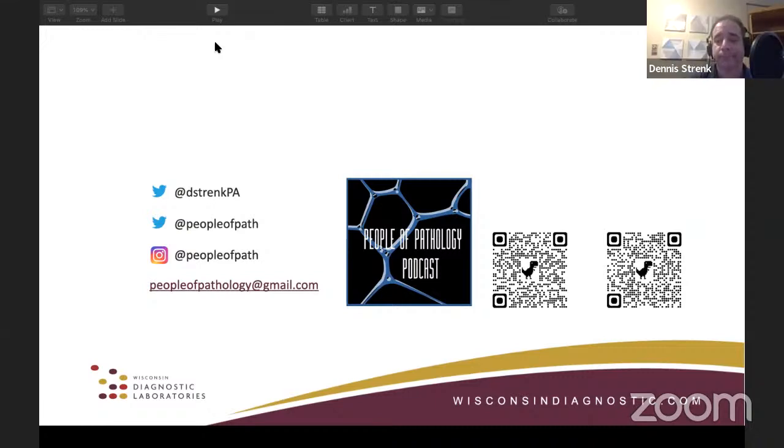And sometimes there is a colon tumor which is big, but not in all tumors is the size important for tumor staging. For example, in a colonic tumor, it is the depth of invasion which is important for correct staging. Then even if it is a bigger tumor, the more important thing is to take full thickness sections which will include the serosa, but not the number of sections, isn't it? Right. Exactly. What other questions?